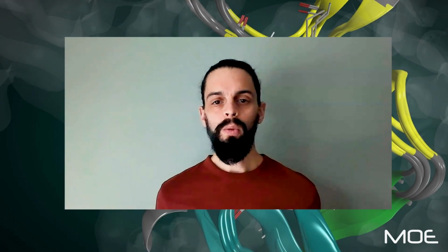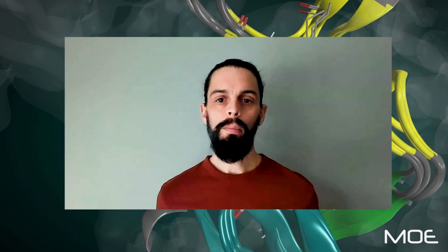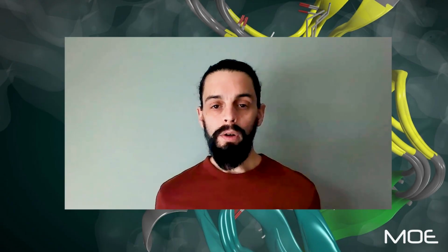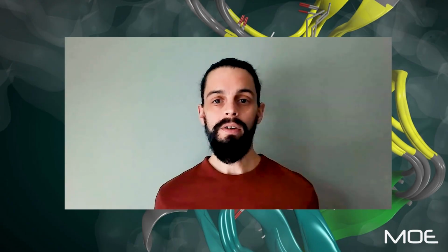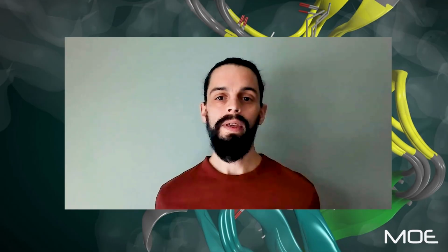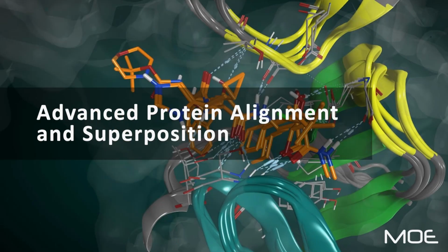Today I'd like to show you how to align the sequences of two or more proteins and superpose their structures. Specifically, we'll look at how to handle multimeric proteins and how to use dendrograms and other visualization tools to help with the interactive analysis. So let's get started.